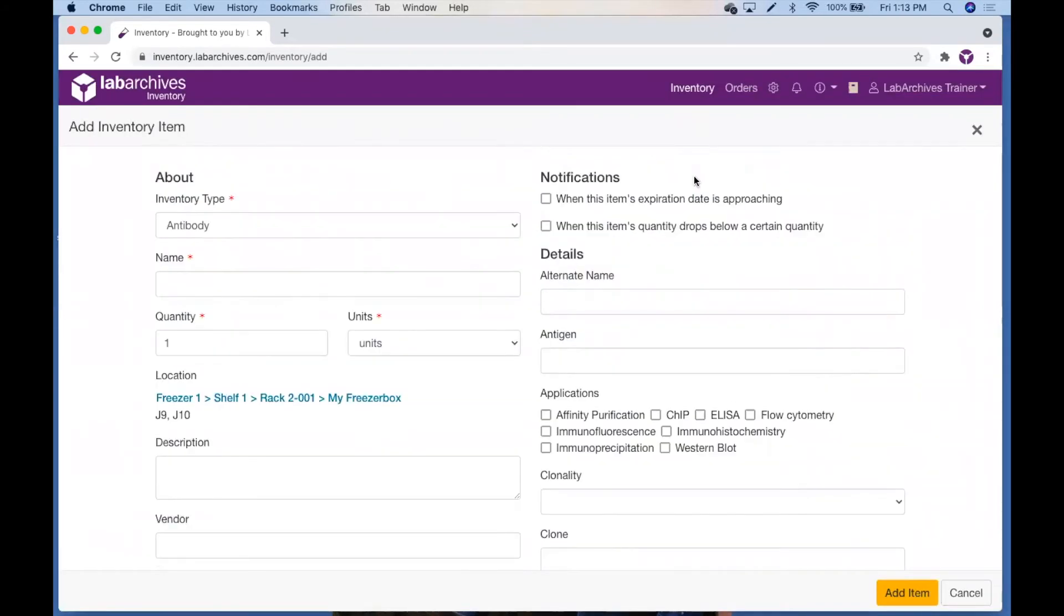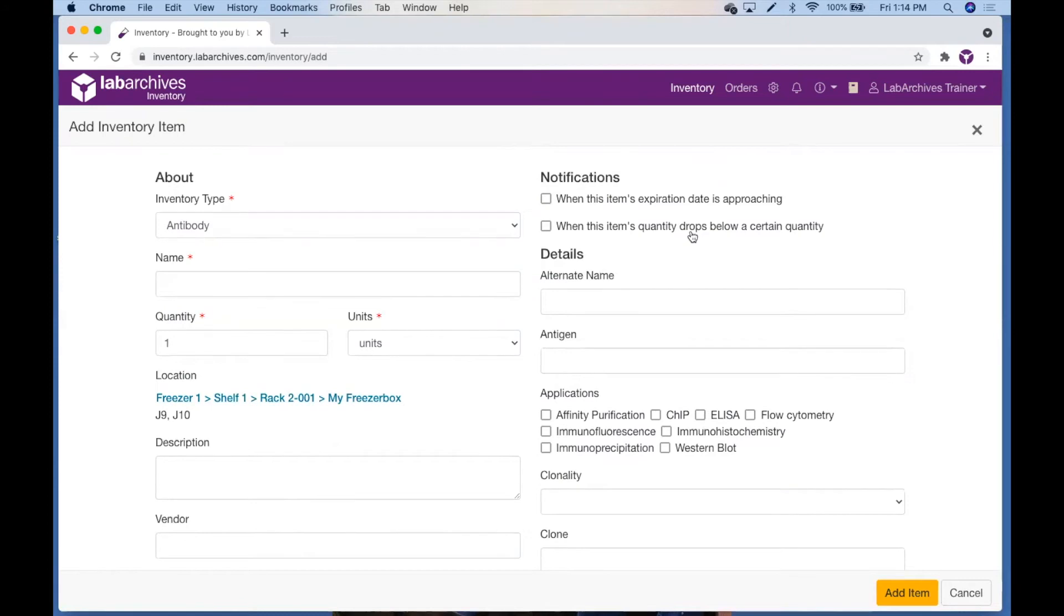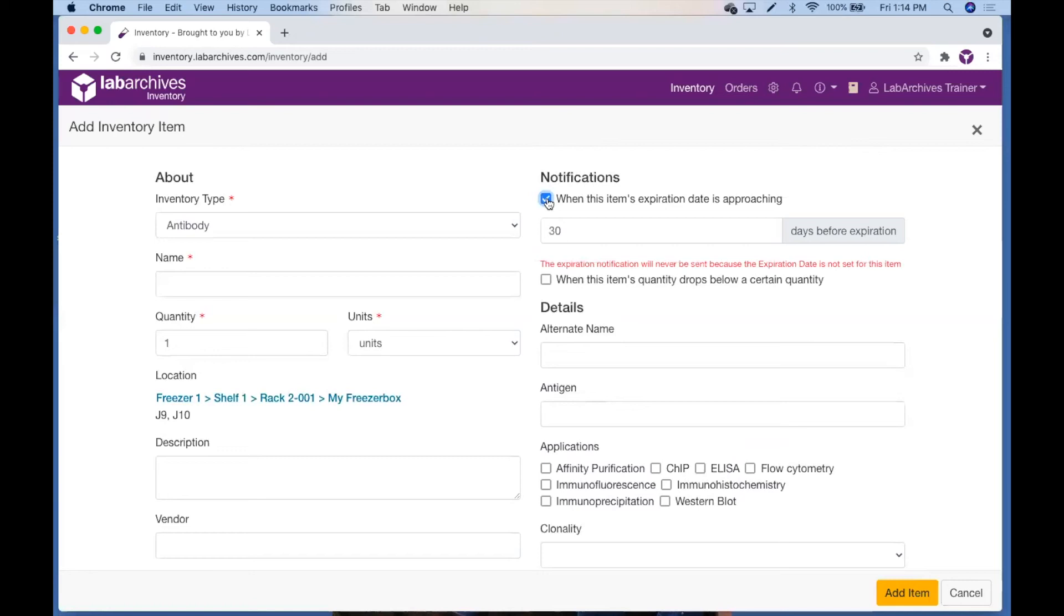In addition to adding information about the item, you have the option to receive notifications for when this item's expiration date is approaching or when the item's quantity drops below a certain quantity. When you check the checkbox when this item's expiration date is approaching, you will be able to select the number of days prior to an item's expiration date to be notified. To select this option, the inventory item must have an expiration date set.